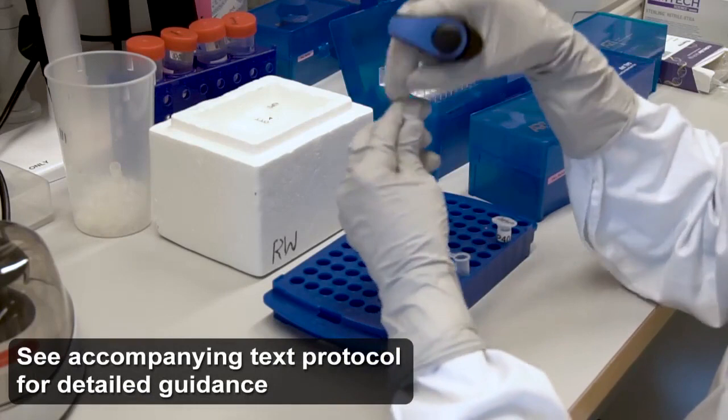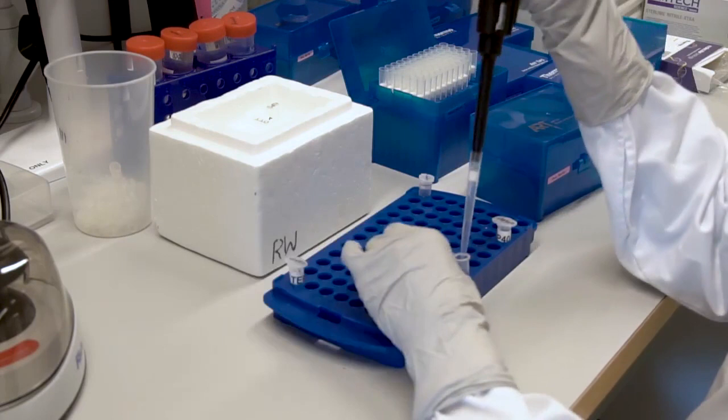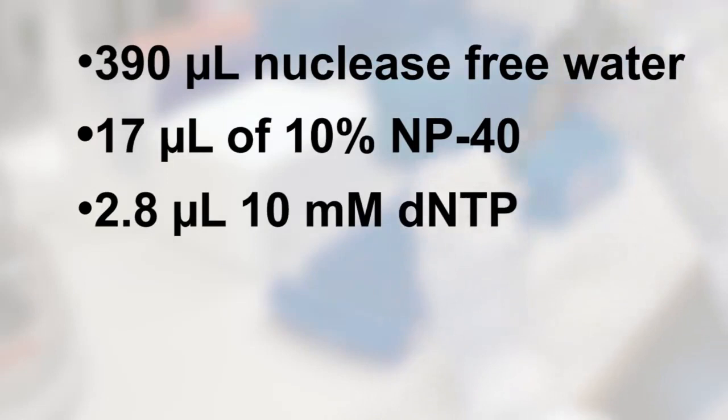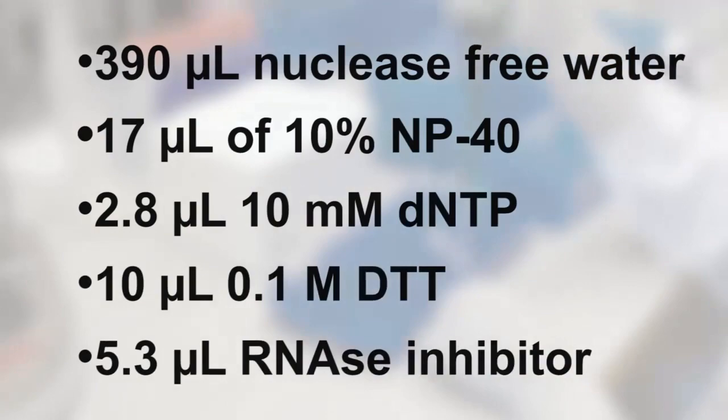To begin the protocol, on an RNA-DNA-free bench, prepare enough lysis buffer for 96 wells, with 10% extra, by mixing 390 microliters nuclease-free water, 17 microliters of 10% NP40, 2.8 microliters 10 millimolar dNTP, 10 microliters 0.1 molar DTT, and 5.3 microliters RNase inhibitor. Vortex and spin down the tube.